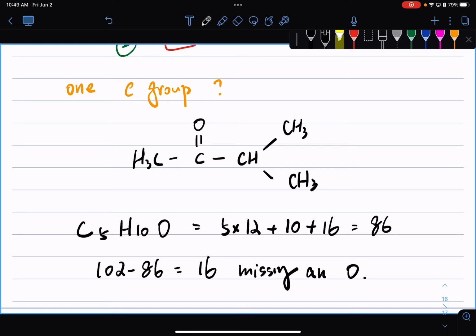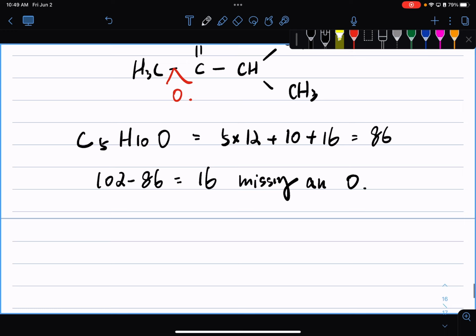All right, now where to put that oxygen? We know that this group must be a singlet, and this one is a little more deshielded compared to the doublet group, which are my terminal isopropyl CH3 groups. So it's hinting it's closer to either an electron withdrawing group or an oxygen. So we can put our oxygen here, and our final answer for this molecule is like this.